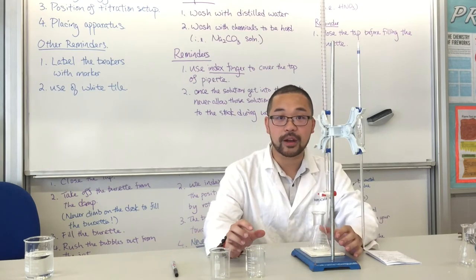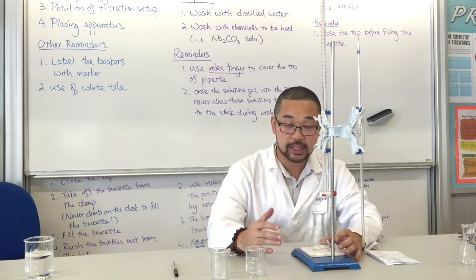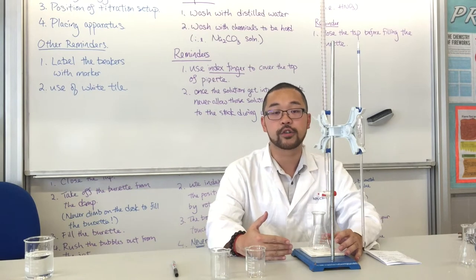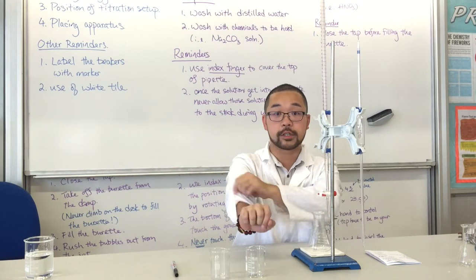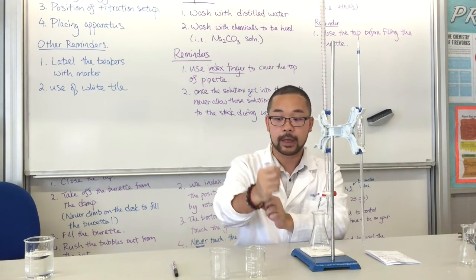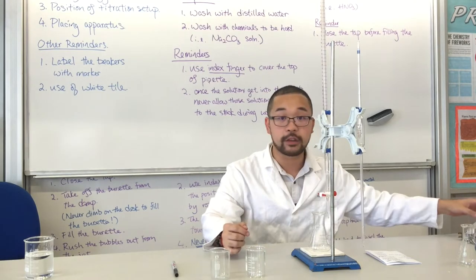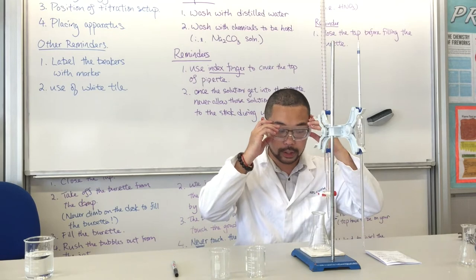Okay, so the first part is about the safety issues. In the SBA, we're going to assess your safety measures. First of all, you should have your lab coat. Remember, don't roll your sleeves. If you roll your sleeves during the SBA, then marks will be deducted. Second one will be your safety goggles. Everyone should have your safety goggles on during the whole process.